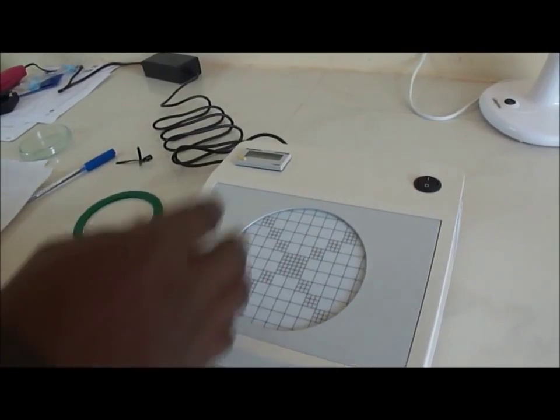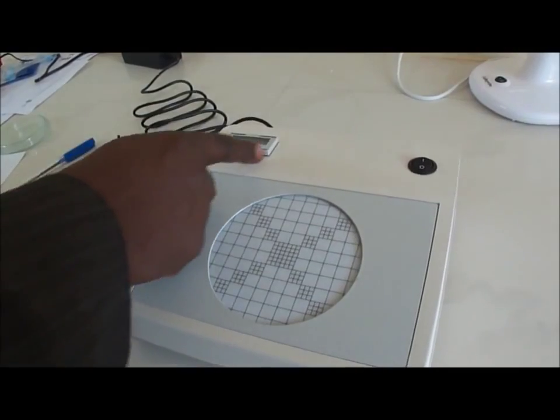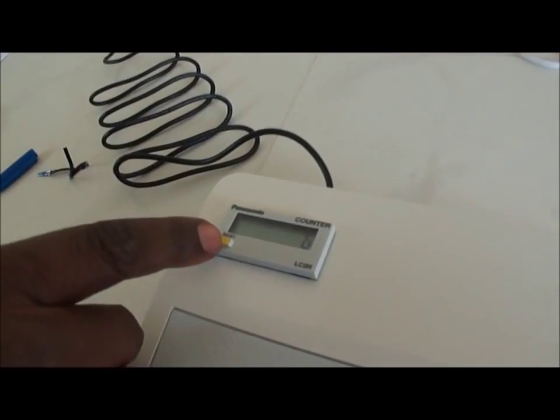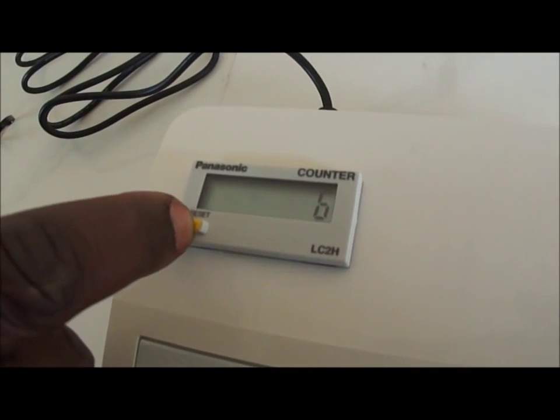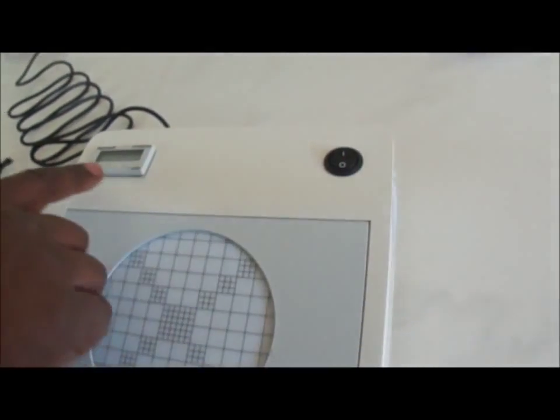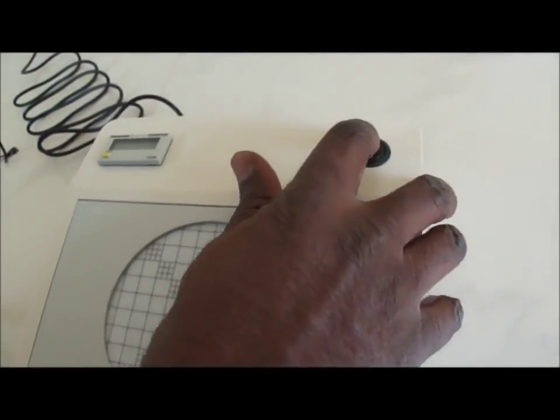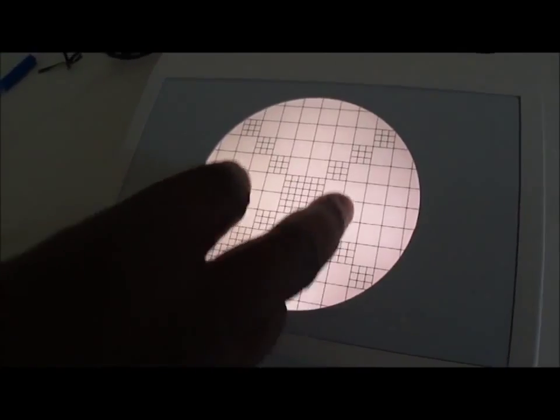Now, if you look at the device itself, it's very simple. You have here first a counter with a liquid crystal display, and you have a small reset button. For example, the number here is 6. If I want to put it to 0, I press the reset and then it's 0. And you have the main switch here. You see here it's working because the battery is providing some energy. But normally I put it on with the main switch.